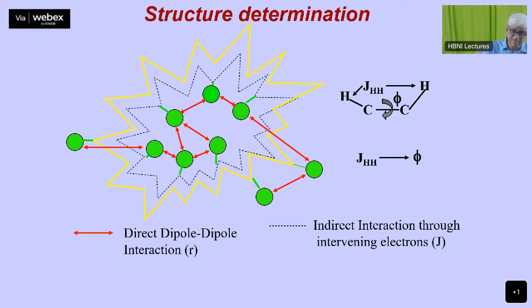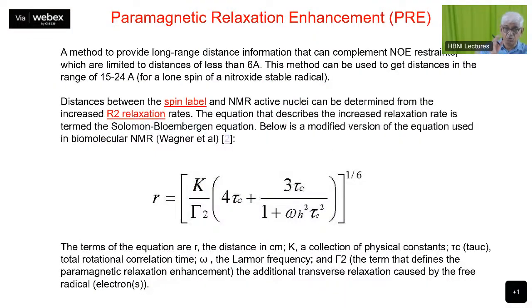You have the various distance inputs from the NOE quantification. And also, of course, as I said before, the NOE is proportional to the inverse 6th power of the distance. You quantitate the NOE intensities, and then you will be able to estimate what sort of a distance it must be. Okay, so that is from the NOEs.